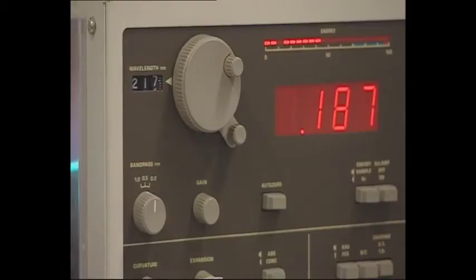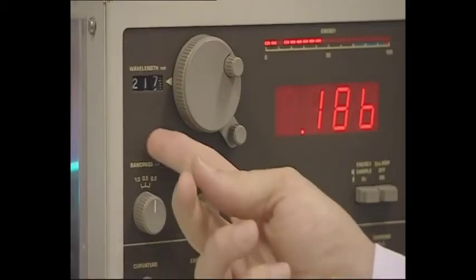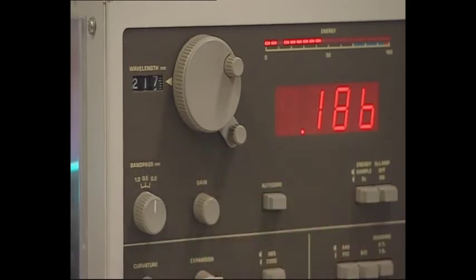The monochromator ensures that light of only the same wavelength as the hollow cathode lamp gets into the detector. We need this as other elements in the flame will also emit light at different wavelengths when in the burner. This can cause false high readings when they arrive at the detector.